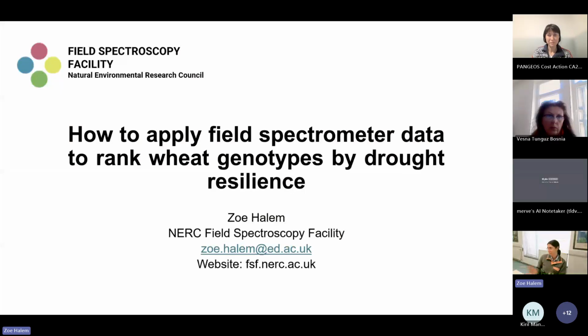I'm the remote sensing technician at, we call it FSF, the Field Spectroscopy Facility. We are a lending library of spectroscopic instrumentation based at the University of Edinburgh. So we loan sensors to academics and researchers to use for free.